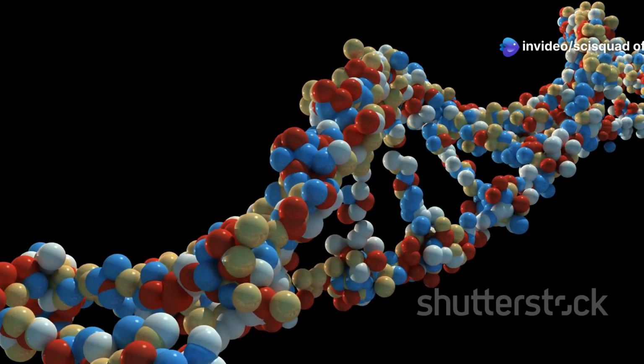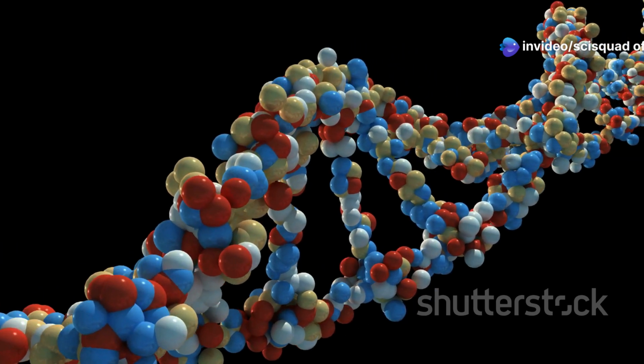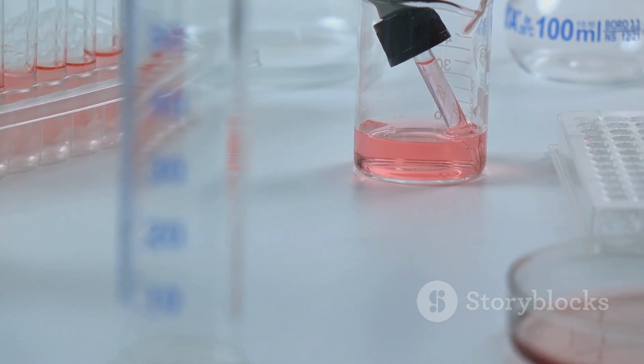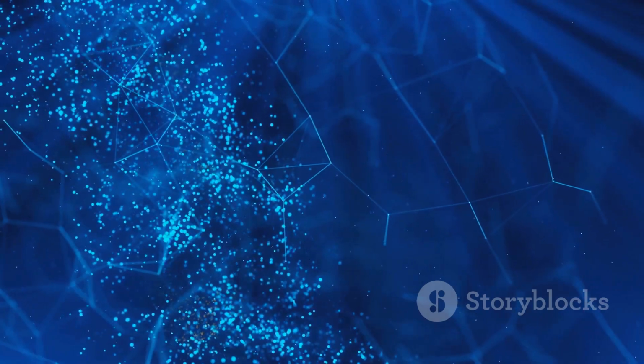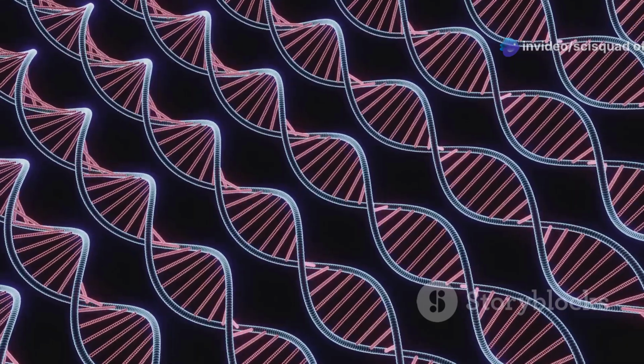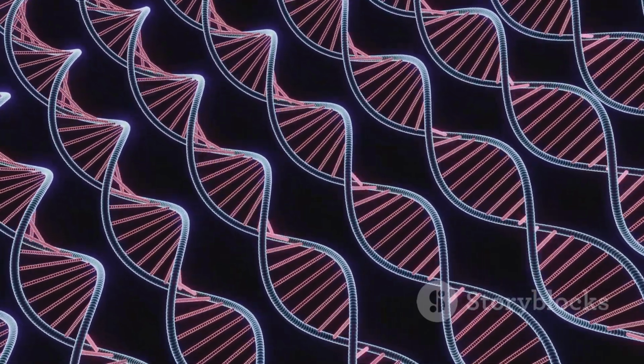Nucleotides come in 2 forms, regular ones called dNTPs and special ones called ddNTPs. The special ddNTPs stop the DNA building process. An enzyme called DNA polymerase adds nucleotides, creating a complementary strand. When a ddNTP is added, the building process stops. This generates DNA fragments of varying lengths.